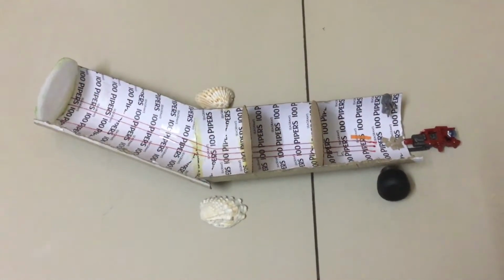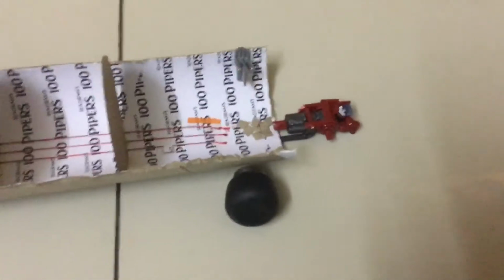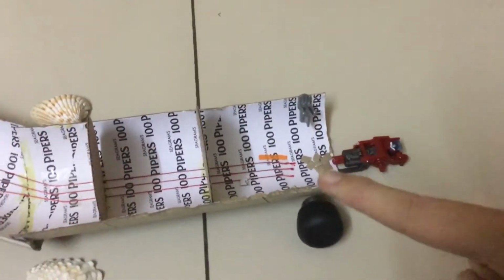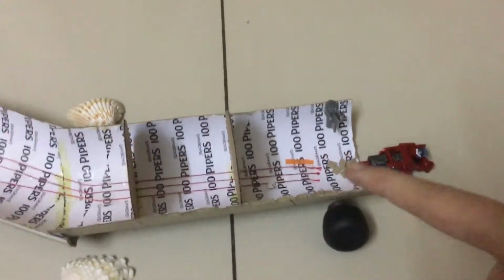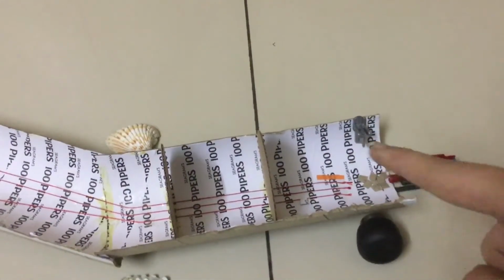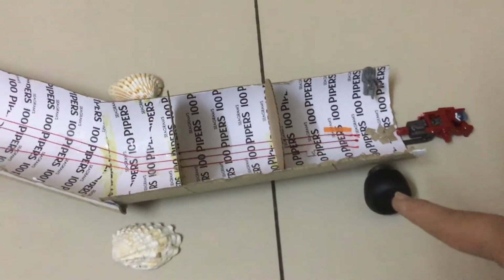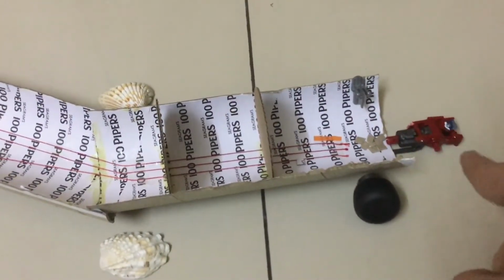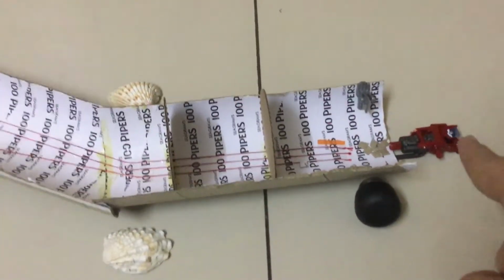Now here we have our model of our mass spectrometer. So at the start over here, we see this inlet, which is used to place the element represented by the cardboard chips inside of the mass spectrometer. Then once it is placed over here, first it is heated by this heating filament, and the heating causes it to vaporize. And once it's vaporized, it is then bombarded with electrons by this electron beam. And what this does is it knocks off some of the electrons in the atoms of this element. Due to this, it becomes positively charged.